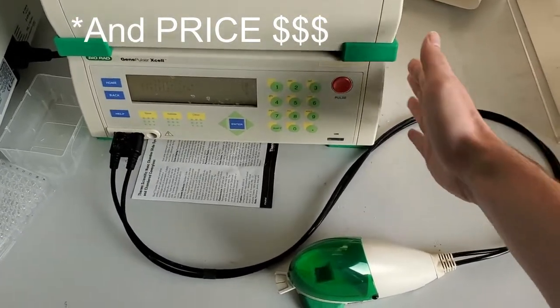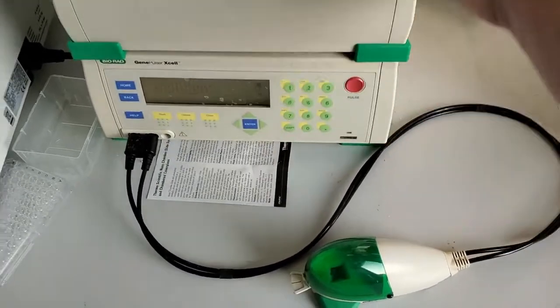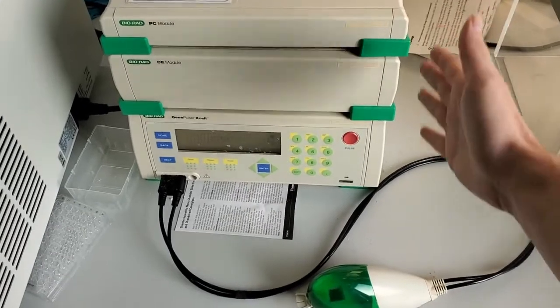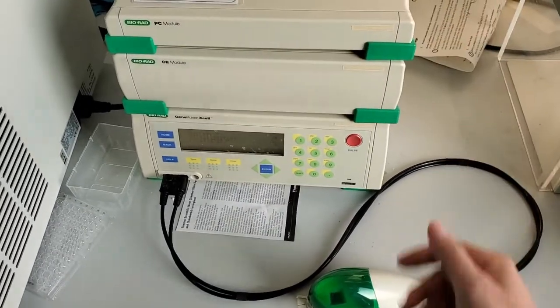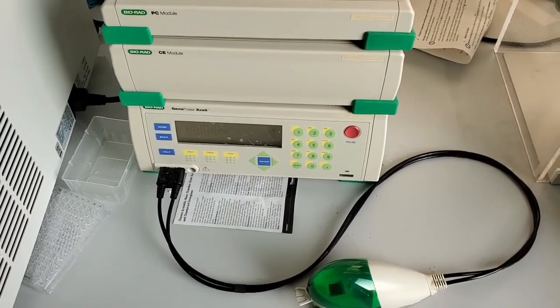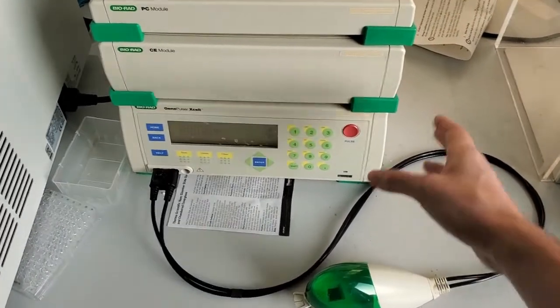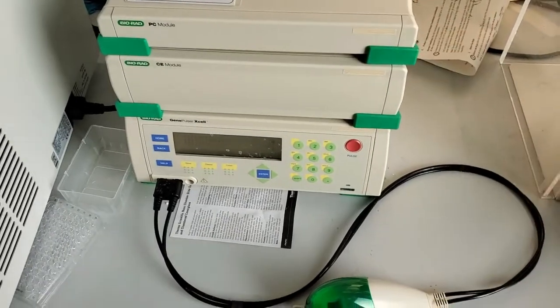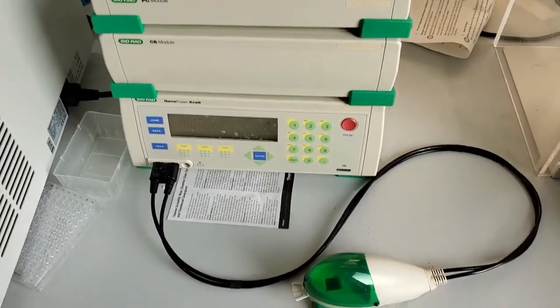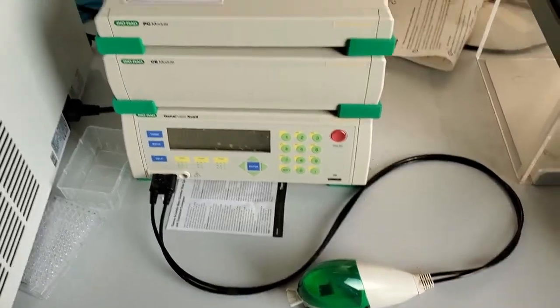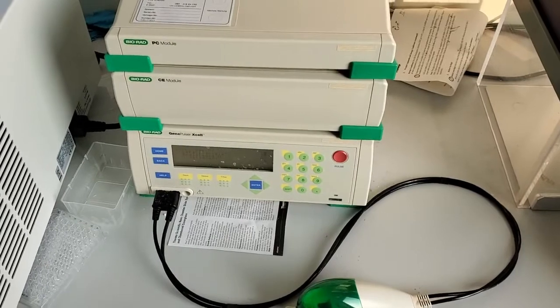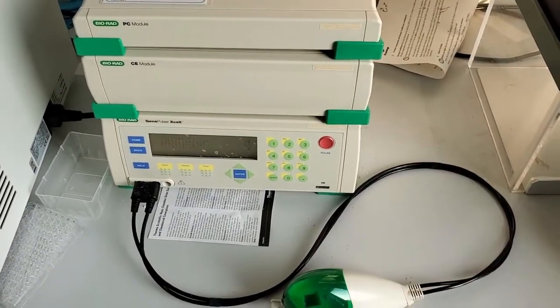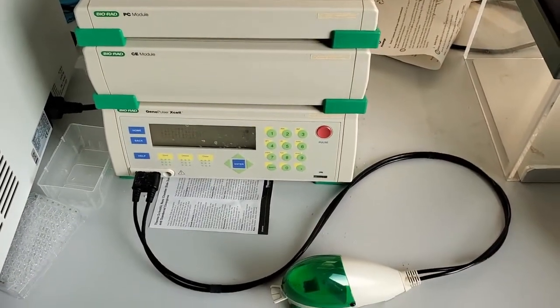So you can see my hand here. It's quite a big instrument. And there are extra modules that can get added, things like that. So it ends up being a little bit bulkier than the small handheld devices I've shown in the past.